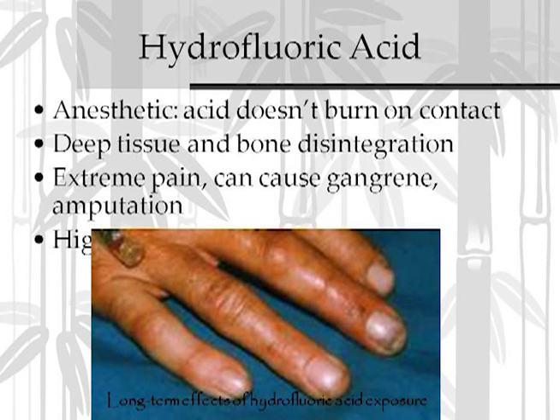And what's particularly scary to me about it is the most common place where we find hydrofluoric acid in schools is in the art program. Because it dissolves glass, it's used for glass etching. So in a chemistry lab, they may be wearing splash aprons, lab coats, chemically resistant gloves, goggles. They may be using it in a fume hood, which pulls all of the vapors away. In an art program, they typically don't have any of these things. Maybe latex gloves, which provide very little resistance to hydrofluoric acid. So these are ones that we really focus on in the art classroom as much as in the science classroom.